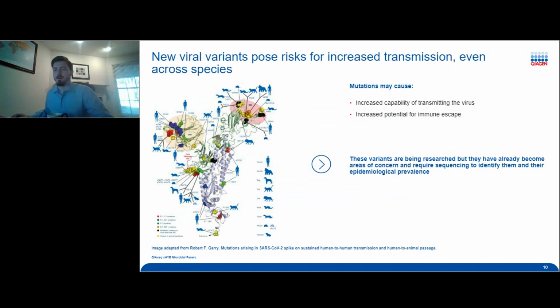Now, many of you may already be aware of the importance of variant tracking of different viruses, but in the past 2 years, the importance of doing variant tracking to keep track of viruses has become much more clear with SARS-CoV-2, where we're trying to track and make sure that there's no widespread virus that is moving towards immune escape away from the different vaccines that have been designed, and give us a little more lead time to design new vaccines if they need to be designed.